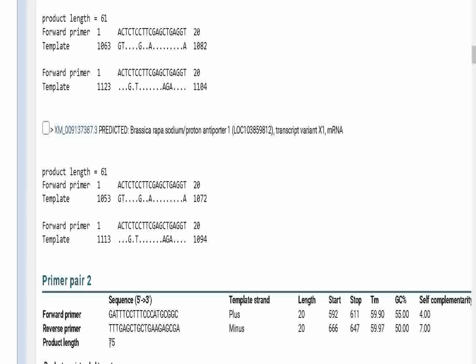So for RT-PCR, I would suggest that you consider the product size to be 150 to 200 base pair, and GC percent here is perfect. It should be between 50 to 60%, and the length is also correct. The ideal length is 20 to 22 nucleotide. One to two base pair lesser or more would be considered. Try to consider those primers which have lesser self complementarity.